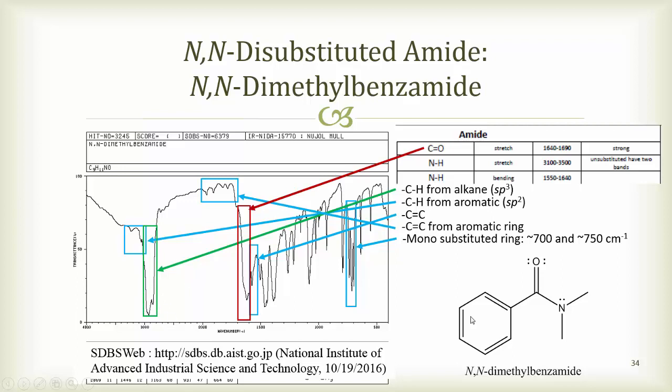So sometimes you see peaks that are very distinct and other times you don't. So I don't always try to make things up if I'm not sure. In this particular case, because it isn't that distinct, the things that I would be sure of are that there are carbon-hydrogen sp3s, that there's an aromatic ring, and that there's a carbon-oxygen double bond. Those are probably the most distinct peaks in the spectra that help me know what I'm looking for.